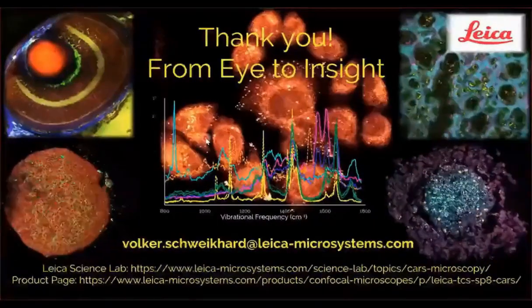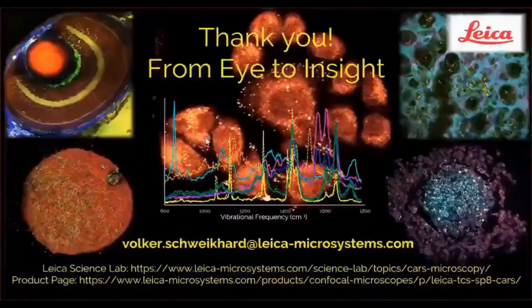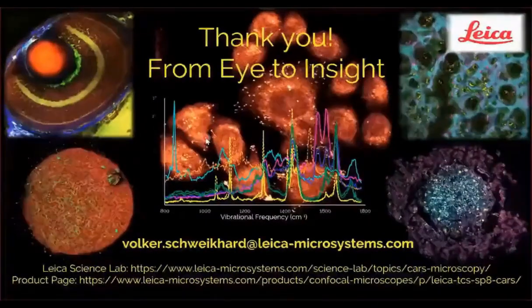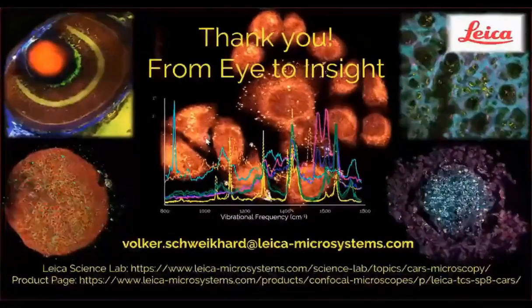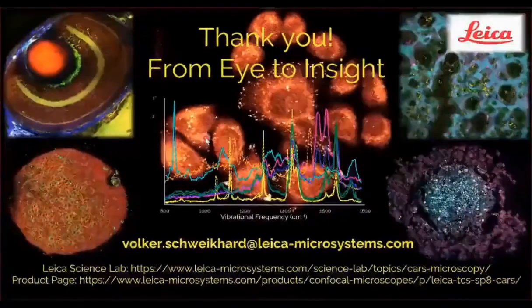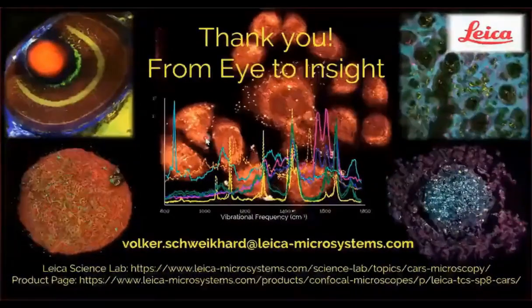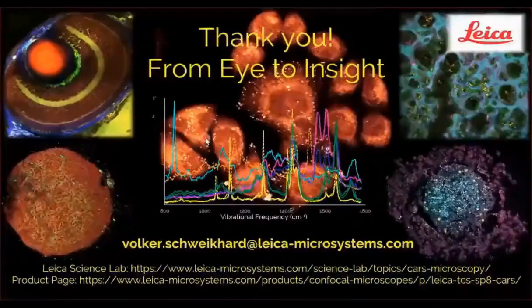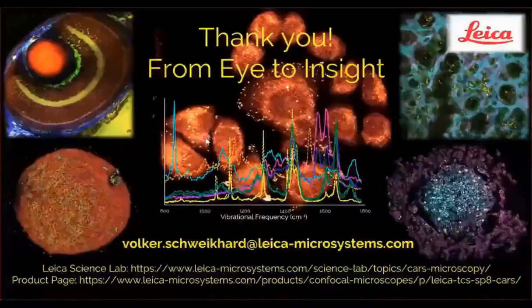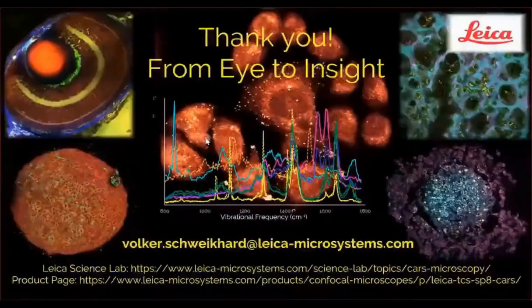We tend to stay away from things like methanol fixation. They tend to remove lipids or affect lipids in the sample. As far as we can tell, formalin fixation is fine and can be used. This has also been studied in the context of spontaneous Raman spectroscopy, and I think the findings there agree that formalin fixation is certainly something that can be done.